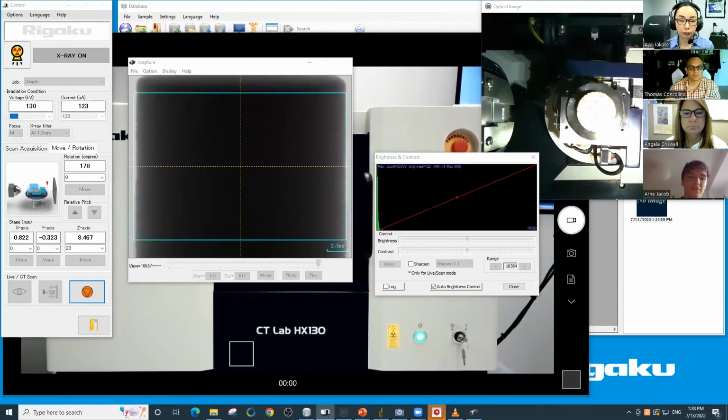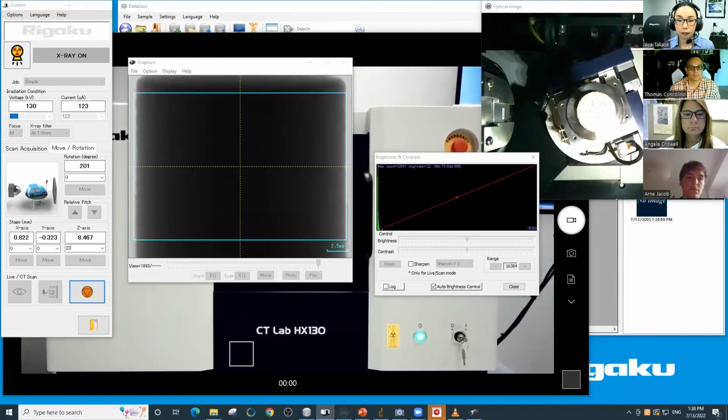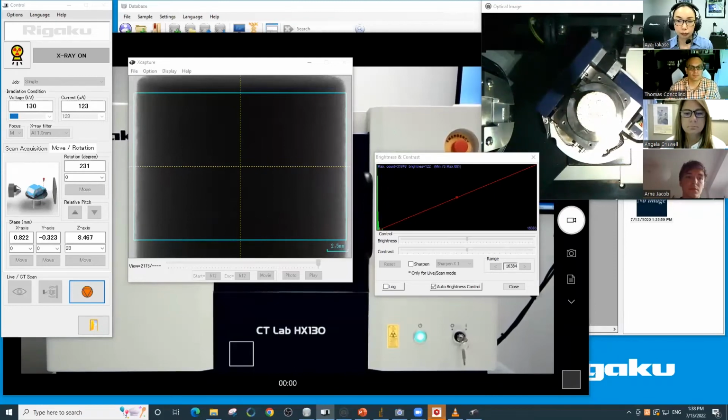The second question was, and actually there's two that are kind of related here. So one is from Boris, the second one is from Jing, and it's asking, can you specify more about the method of how to find the correct REV? So, do I have to find the minimal REV, which has similar pore parameters for different samples, compare it with physical experiments, et cetera?